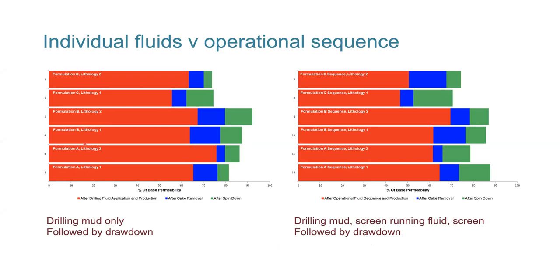So now on to just a couple of slides on some of the ways that we can move from these traditional metrics and data that I talked about here to giving better data. Now, one of the things that's typically done in the formation damage world within vendors, within operators, within labs is, we're drilling a well, let's just look at the drilling fluid alone and use that as a metric. So this is real data here.